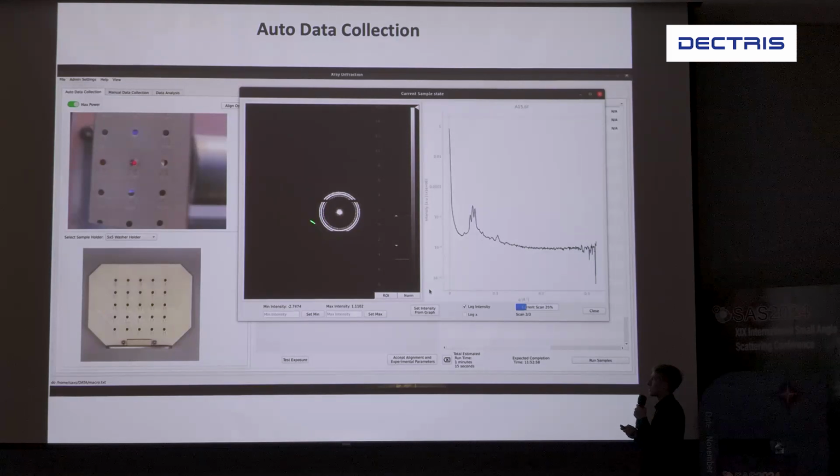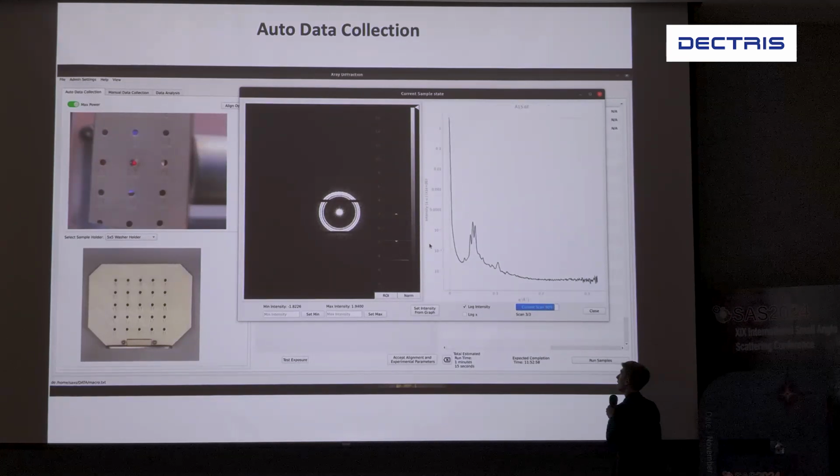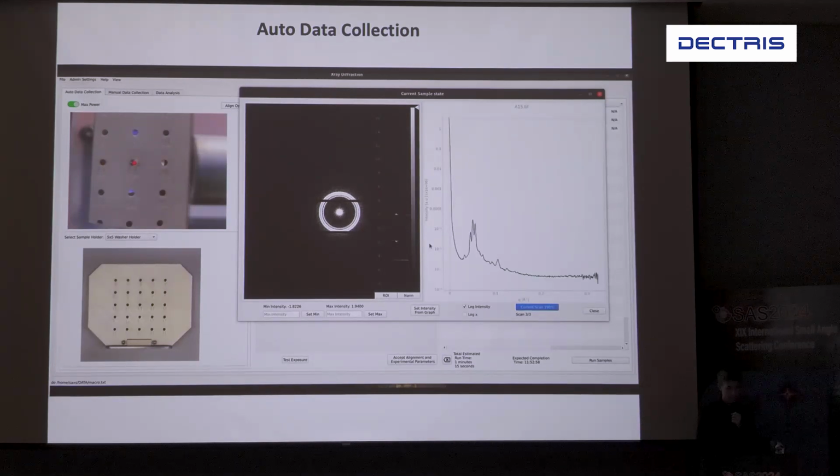So this is the nice thing about the source and detector itself is that it has a very high angular resolution. On our downstairs microfocus source, we are unable to resolve these 3 peaks in the A15 phase. Yep, so that's all there is to it. So you can see that it's very simple to run a sample.